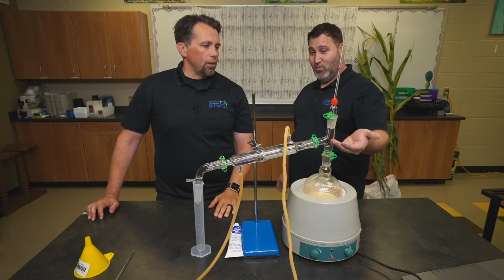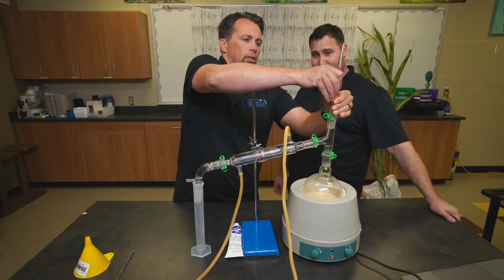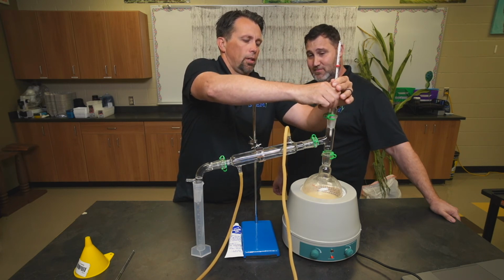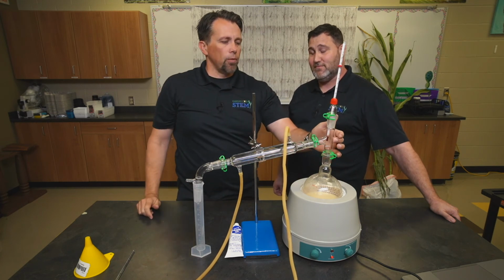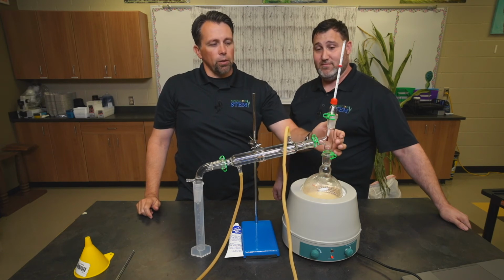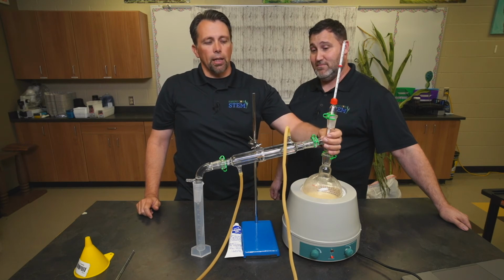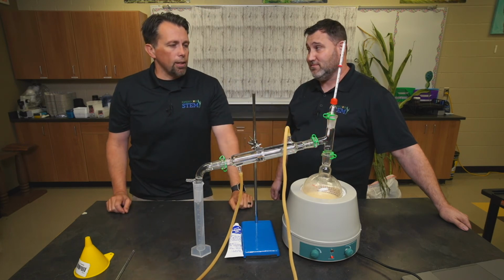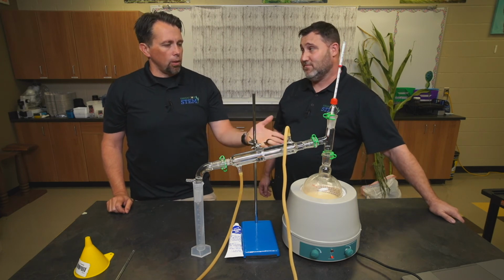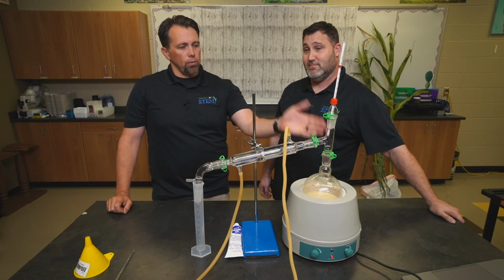James, would you like to talk about where you place the thermometer and why? This thermometer seals up here so you can adjust it, but you want it right where the junction is, so you know what the vapor temperature is right here. It doesn't matter so much what it is down here or anywhere else. If it's 80 degrees Celsius here, that's the boiling point for ethanol, so that's what's going to be condensing at that point. If you overshoot that, you'll be getting a lot more water driving across. In the other glassware, you had to heat it quite a bit higher, into the 90-degree range, to push it over.